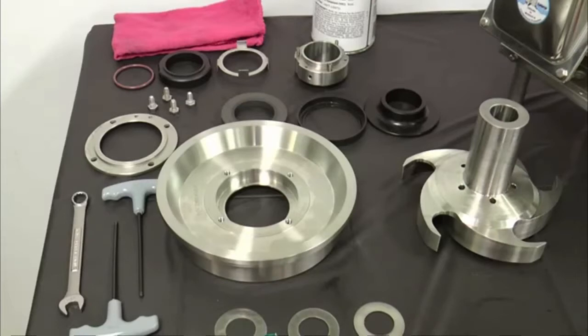Inspect all O-rings and O-ring seats for abrasions, cuts, or other wear that could cause leakage. Clean all seat areas and alignment surfaces. Please note that the stationary seals are reversible — use both sides before replacing them. Replace the rotary seal when the seal face extends less than 1/32nd inch or 1 mm from the body.